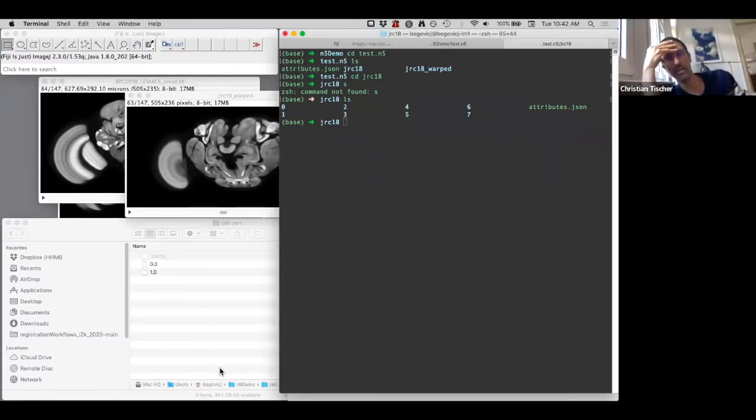Same question. Actually, I had a very concrete thing, because I think with OME-Zarr there's a clear roadmap, right? There should be just one standard, and I hope everybody will just use it. But seeing this, I was wondering whether we should already push the tooling a little bit more so that the same metadata that we have would also work with H5, because this was not really on my radar, and I'm not sure if anybody is actually pushing that or writing code.